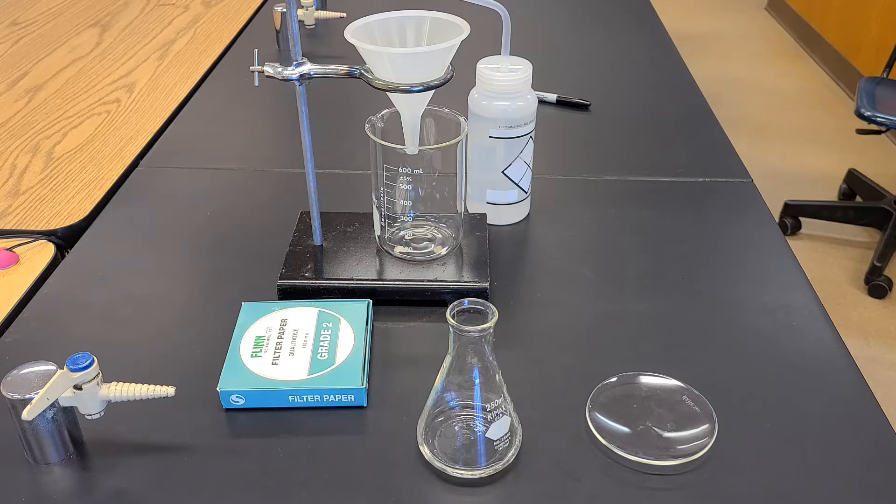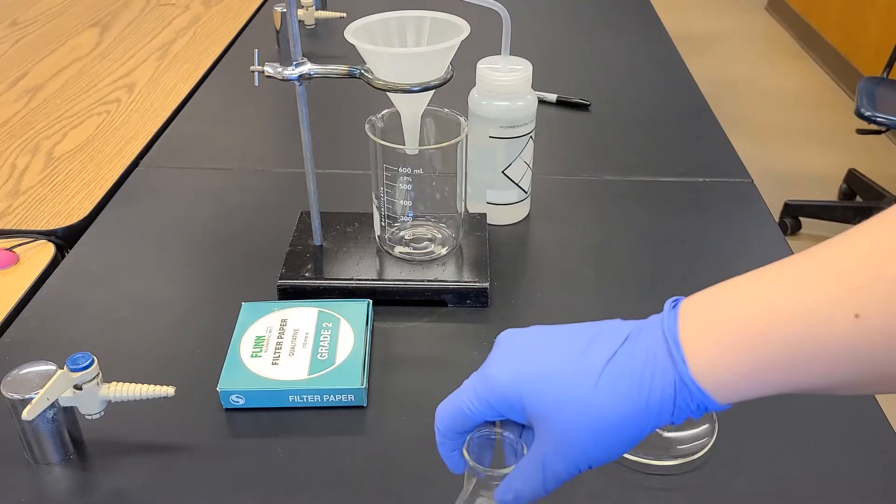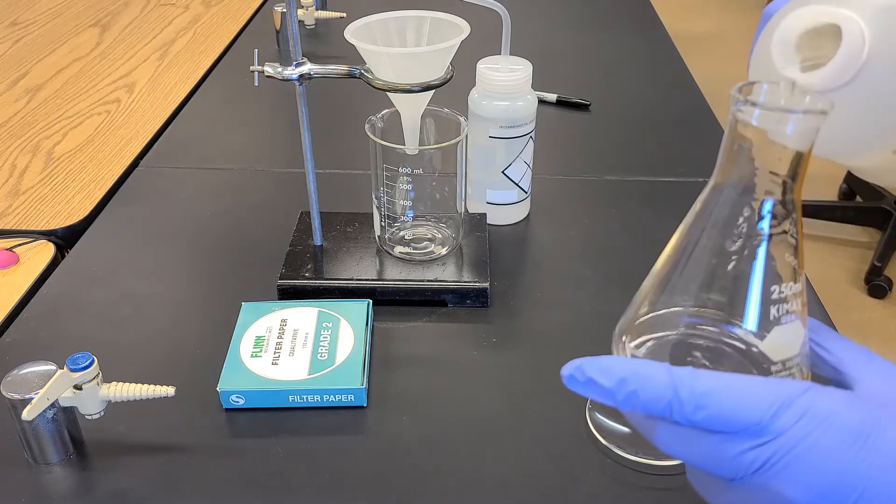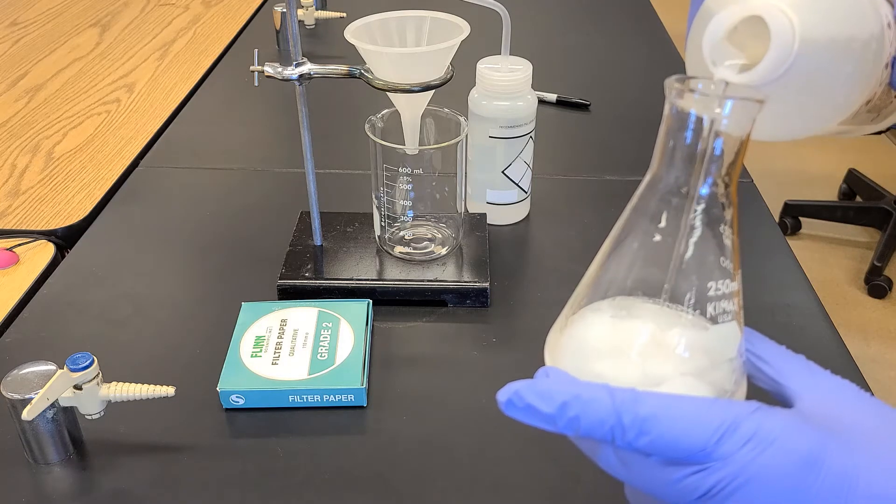I know the concentration of my sodium carbonate is much higher than what I have in my water for calcium, so it doesn't really matter how much of this I add as long as it is in excess.